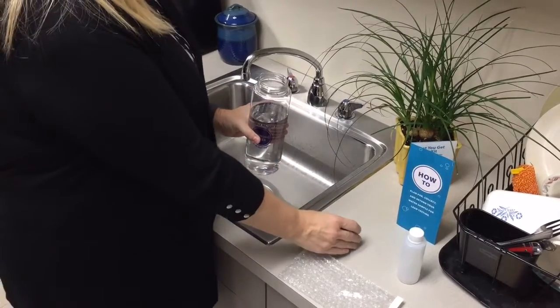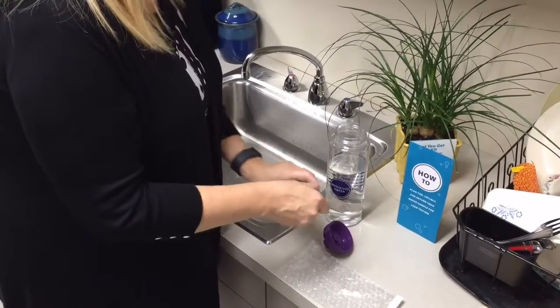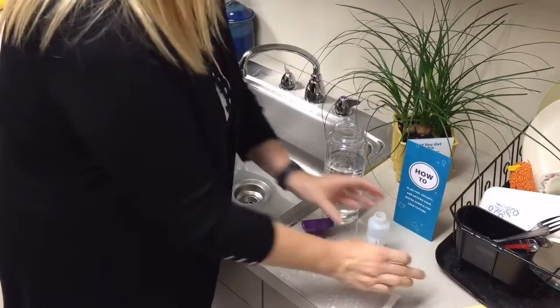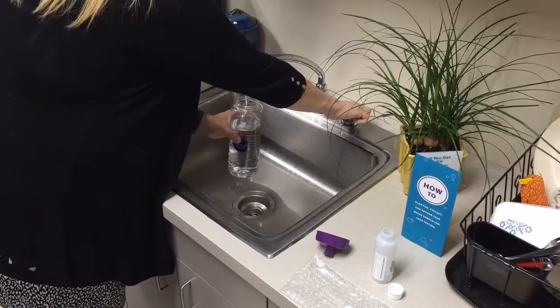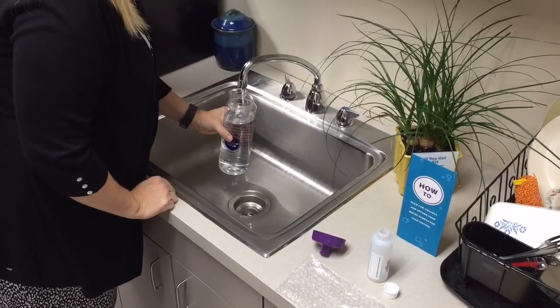Remove the lids from the large sports bottle and the small sample bottle. Put the large sports bottle under the cold water faucet. Turn on the cold water faucet slowly and fill up the bottle to the neck.